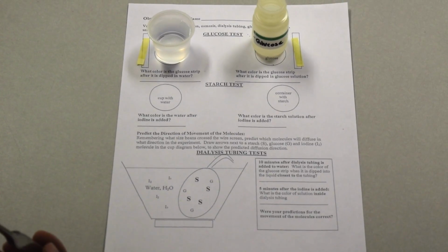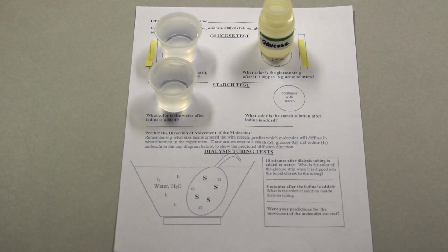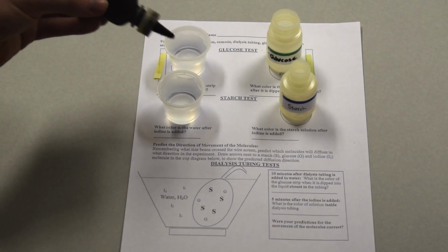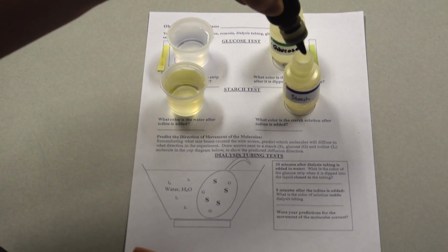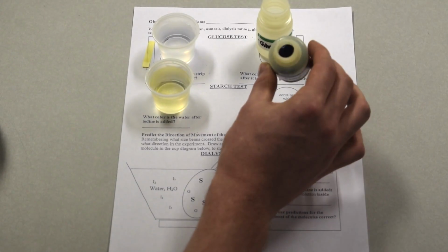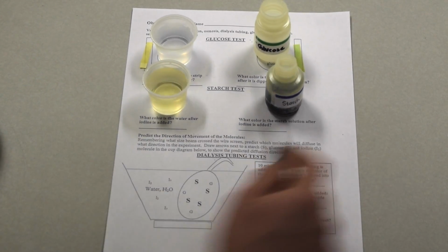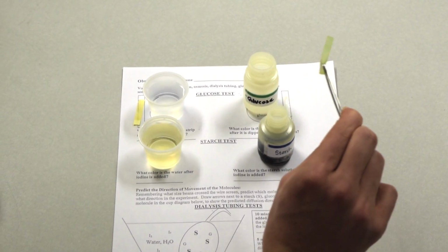Next, we'll test for starch. Pass out another cup of water, a starch solution, and a bottle of iodine. Have students squirt a small amount of iodine into the water and squirt another amount into the starch solution. A purple or black color indicates that there is starch in the solution. And for the glucose test, a green test strip indicates that there is glucose.